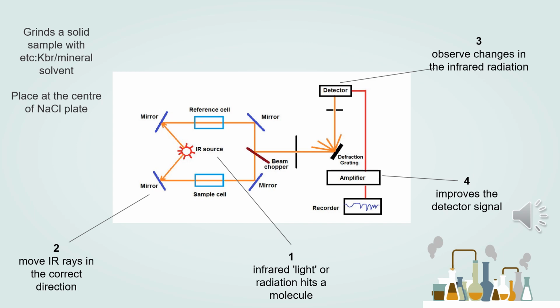It will be placed in a special device to allow the sensor to shine through it. Sometimes we will mix the solid samples with solvents like mineral oil, which gives us limited and known readings in the IR printout. To use the liquid method, we place a sample between two plates of pressed salt, which is NaCl, sodium chloride, to allow the infrared light to shine through it.